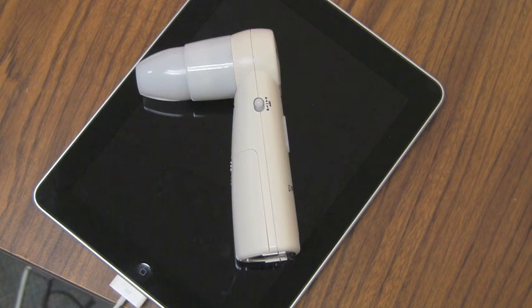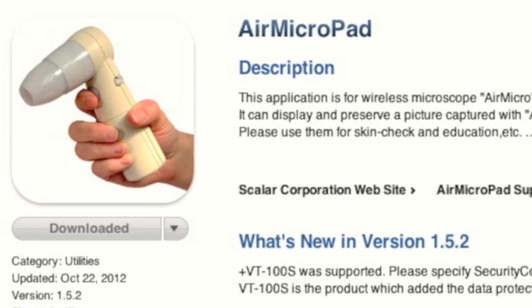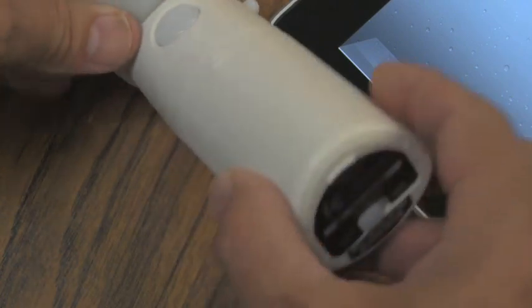Setting up the ProScope Mobile on your iPad is very easy. First, go to the iTunes Store and download the free AirMicroPad app. While the app is loading, install the three included AA batteries.